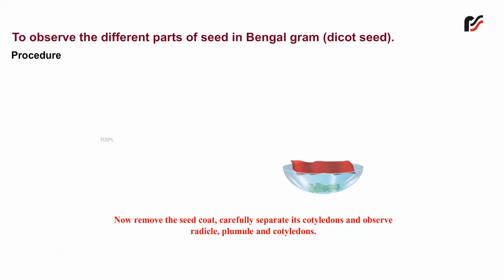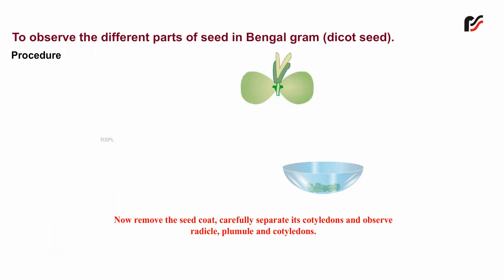Now remove the seed coat, carefully separate its cotyledons, and observe the radicle, plumule, and cotyledons.